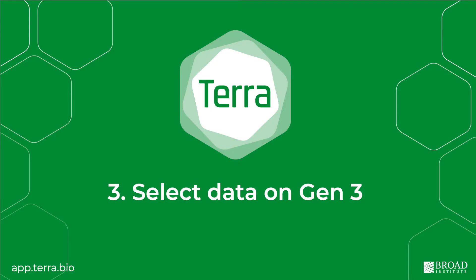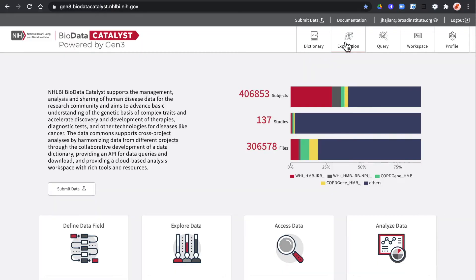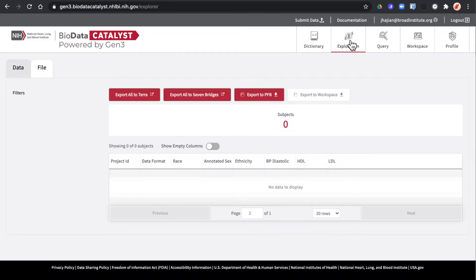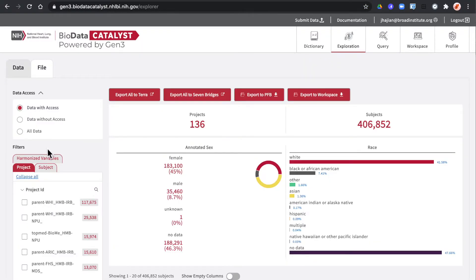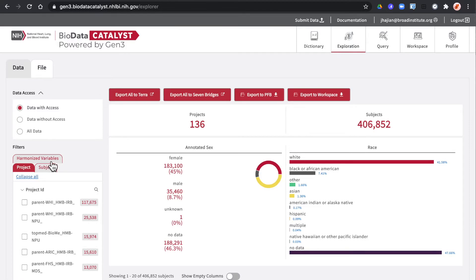Once you have your link it's time to return to the Gen3 platform to select the data you want. From the exploration tab you can use the faceted searches on the left to search by project, subject or harmonized variable.